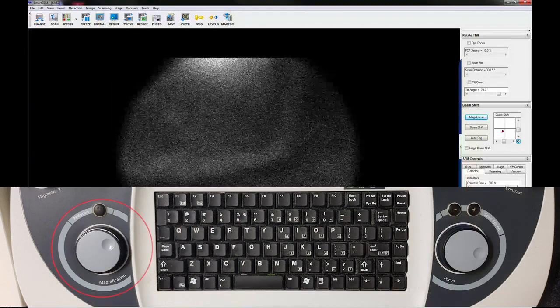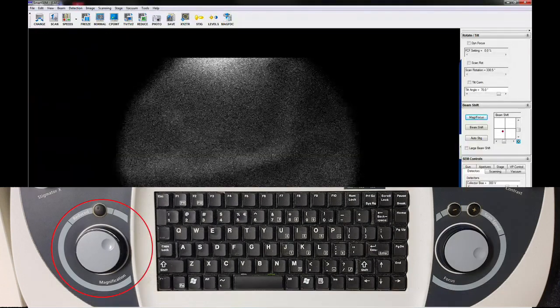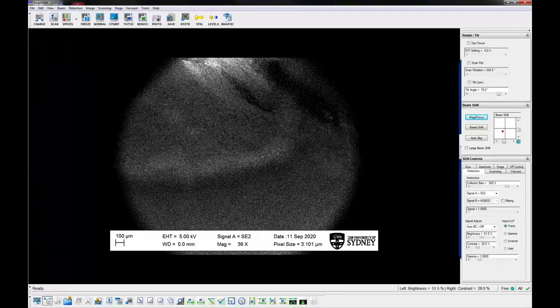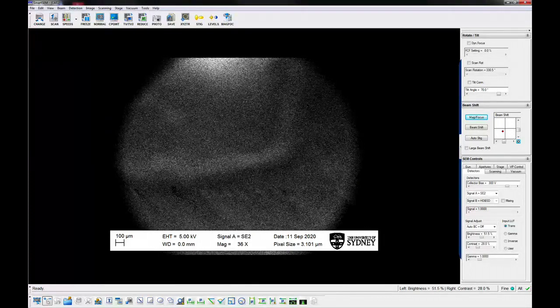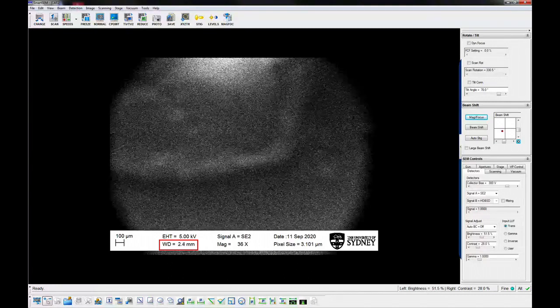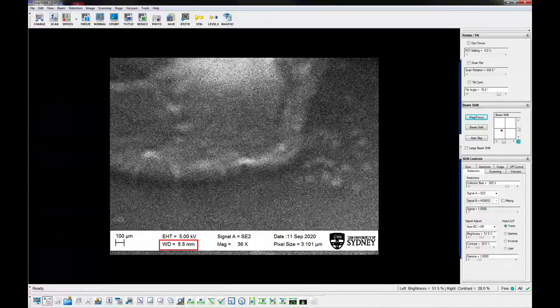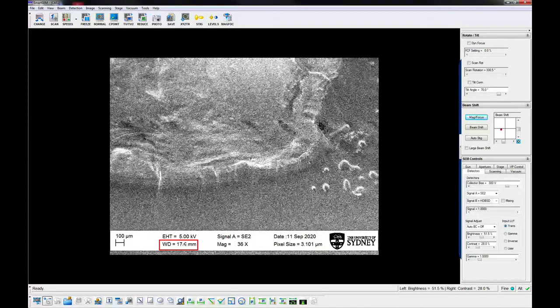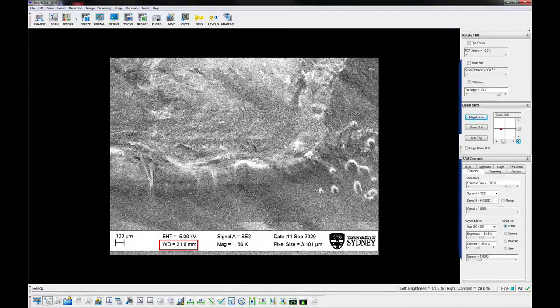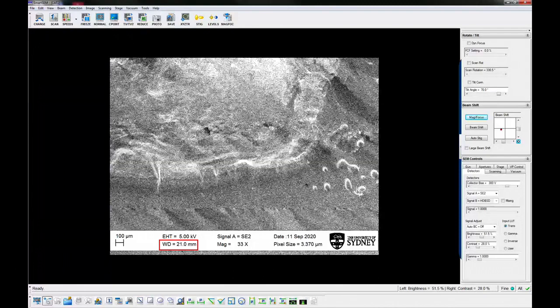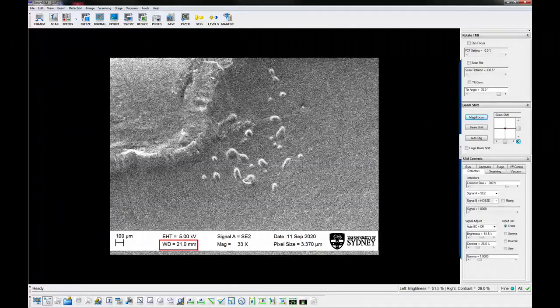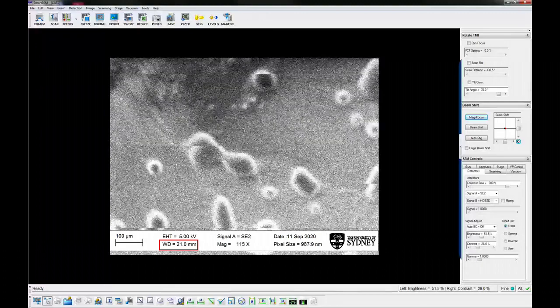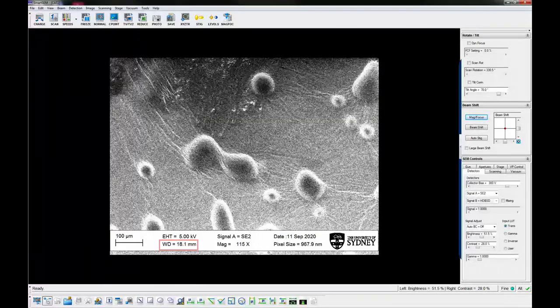Move to the lowest magnification using the magnification control on the keyboard to easily locate and focus the sample. Note that the working distance displayed in the data panel is only correct when the image is in focus on your sample. After achieving a reasonable focus, gradually increase the magnification and focus again.